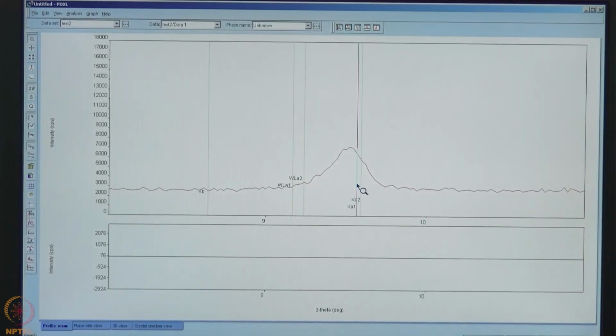So this particular powder X-ray diffractometer does not use monochromatic radiation, but uses just copper K alpha 1 and alpha 2 as a mixture, and hence the peak finding software indicates the possible positions for K alpha 1 and K alpha 2 as well.